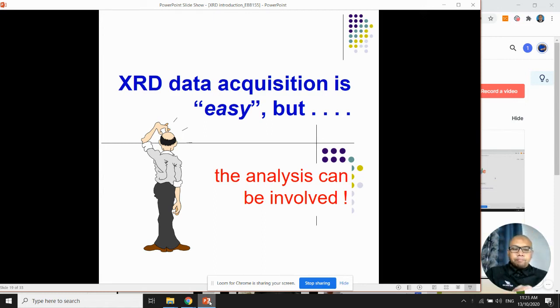Okay, we continue again with the last part of the explanation for XRD analysis. For this last video, I want to explain data acquisition for XRD analysis. Analysis for XRD is very important, in order to assist you in finding your answers.